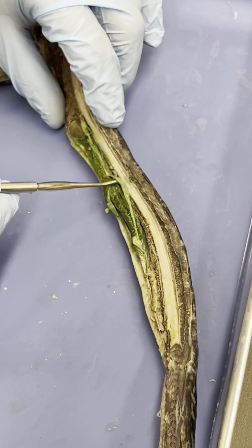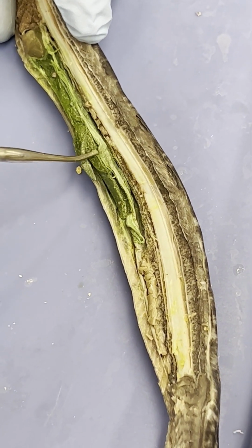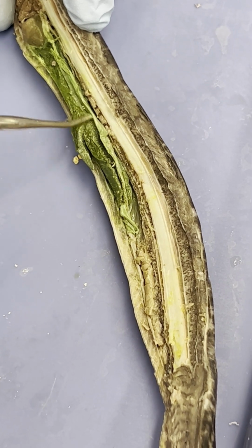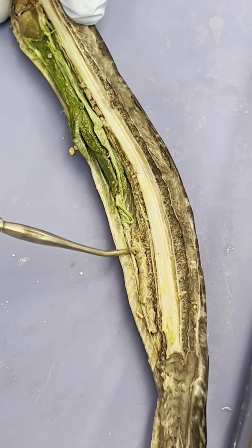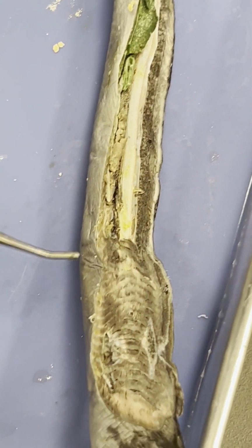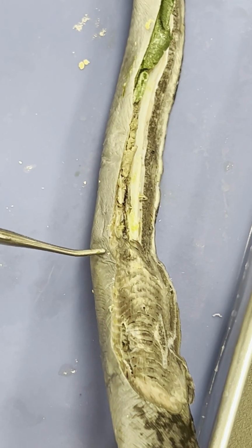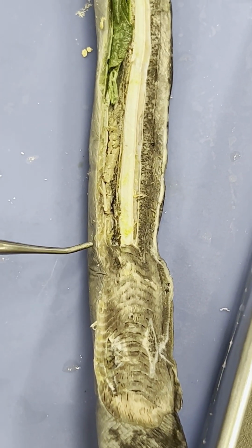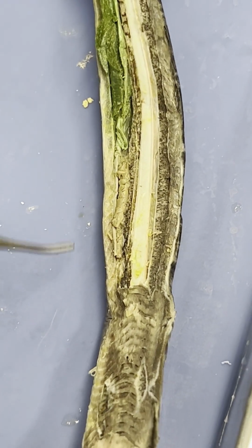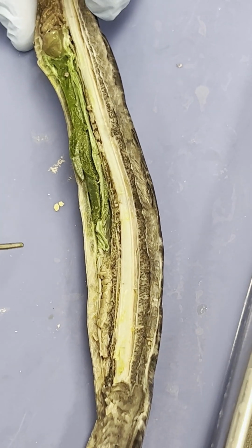What I'm lifting up right now is the intestines that go all the way from the buccal cavity all the way out, actually to the cloaca. It's harder to see now, I'm trying to look for it, because we actually did a sagittal cut. But as you guys can imagine, the cloaca is the all-purpose chute, so all the digested food that's going through the intestine at this point is going to come out of the cloaca.